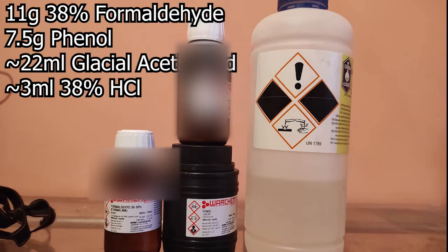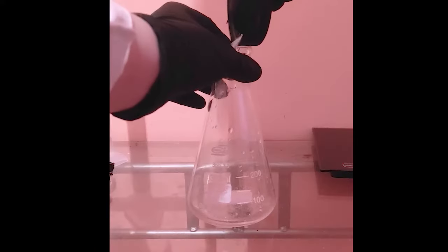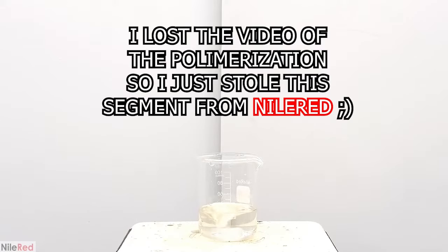For the synthesis I'll be using 11g of 38% formaldehyde, around 20ml of glacial acetic acid, some hydrochloric acid, and 7.5g of phenol, which was weighed off camera. After weighing the substances, I add the formaldehyde and phenol to the flask. After the phenol has dissolved, I pour in the glacial acetic acid. I then transfer some of the solution into a beaker and begin the polymerization by adding hydrochloric acid.